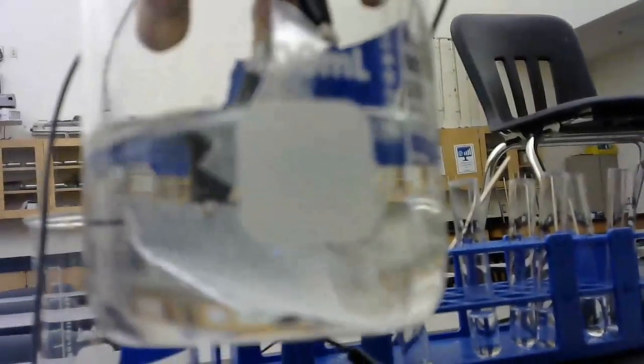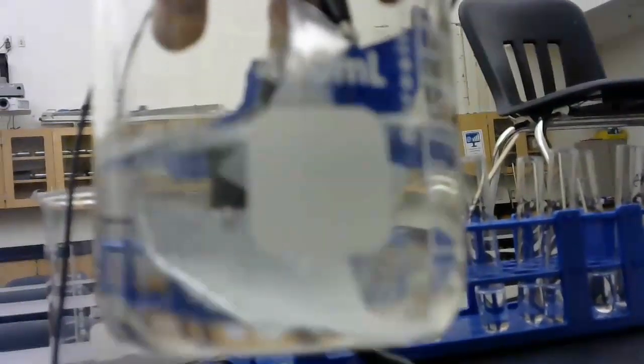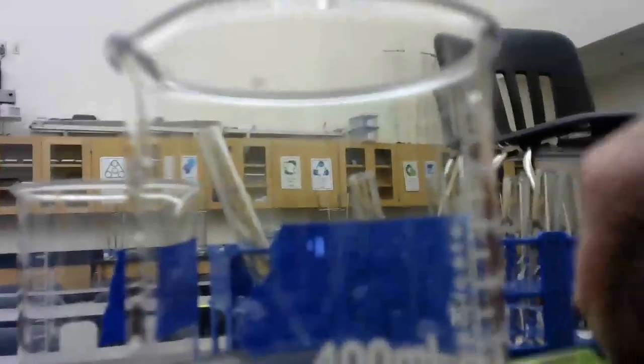Okay, so what's happening there, and you might want to see if you can find a video of this a little bit more clear. But what's happening there is I'm running electricity through my water, and that's causing my water to break down. I am legitimately decomposing water there. I'm breaking water down into its components, okay?